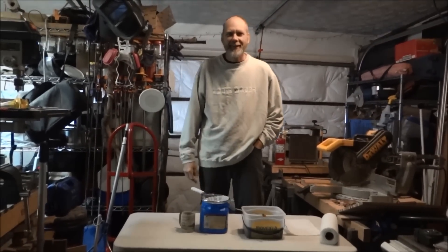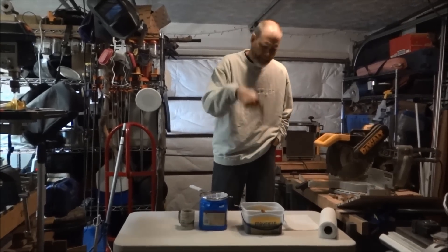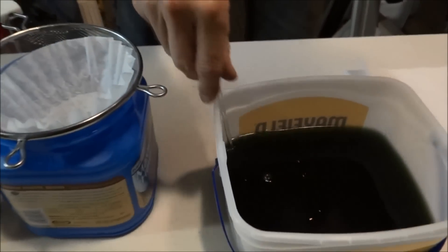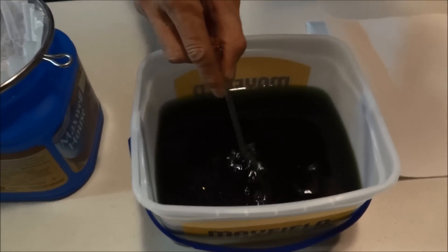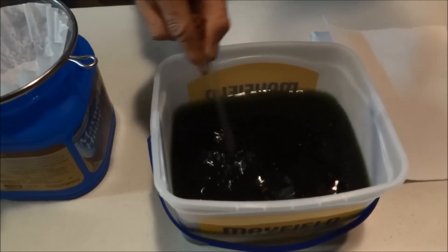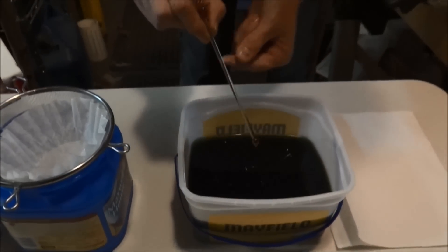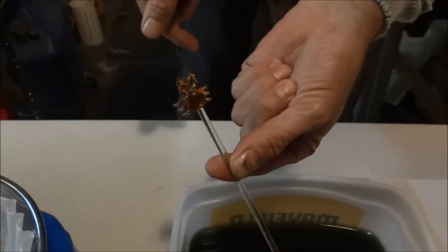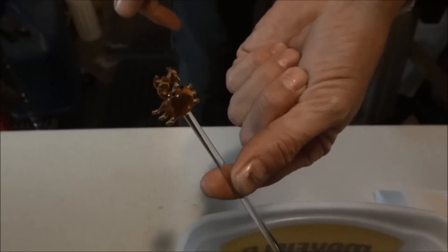Here we are on day two — it's been exactly 24 hours. We let this sit outside in the sunlight and inside at night. You can see something like gold on there already. I'm going to stir it up a little bit with a glass mixing stick.